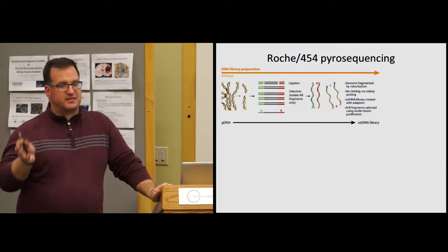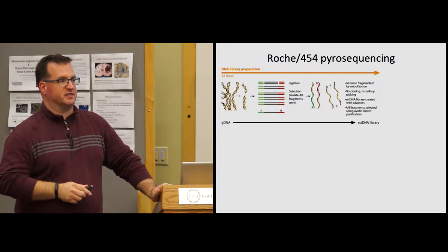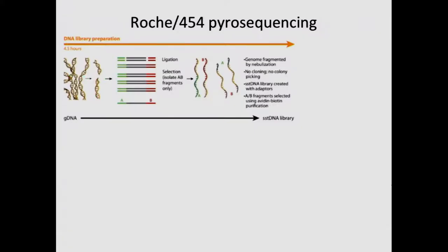So fundamentally, every sequencing technology starts with some kind of DNA sequence library preparation step, and we'll talk a fair amount about this. In this case, you start with some DNA sample that then gets fragmented, whether by nebulization or by shear force or some sort of either biophysical or chemical process. The DNA gets broken up into smaller pieces, double-stranded. There's a ligation reaction in which different controlled sequence probe sequences are ligated onto either end of the fragment. This is a blunt-ended ligation.